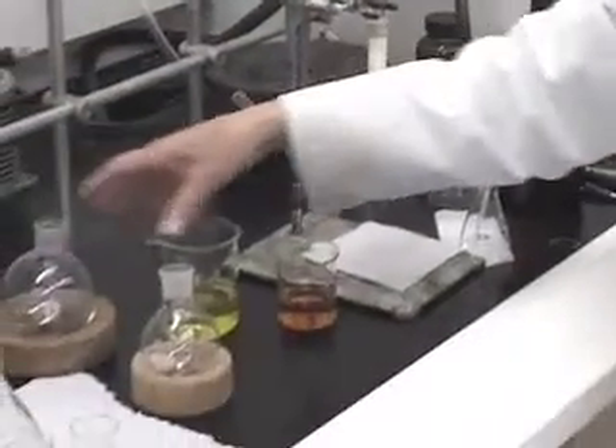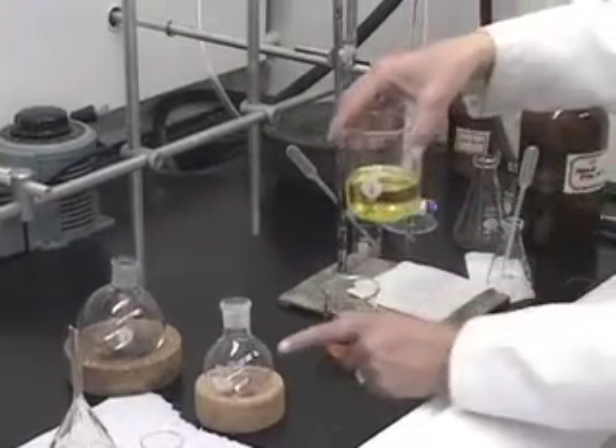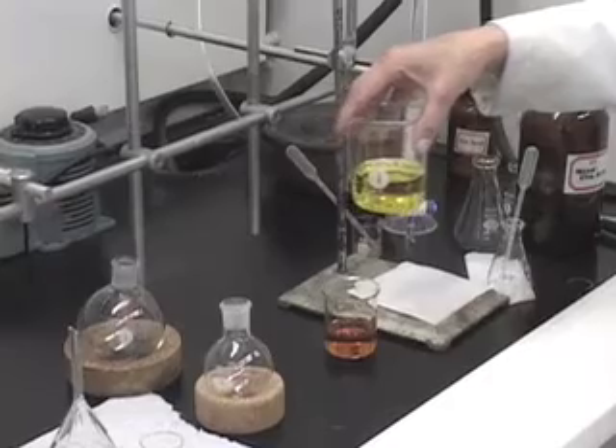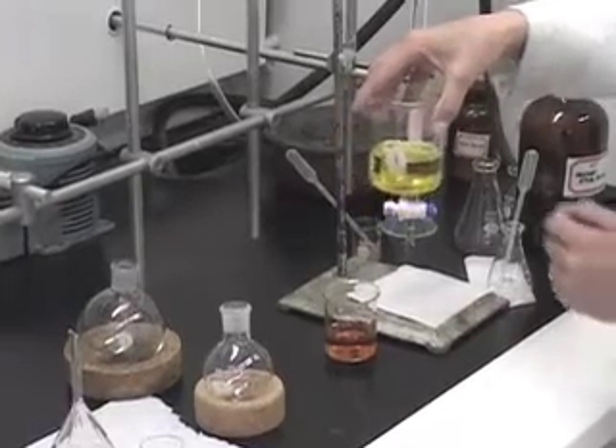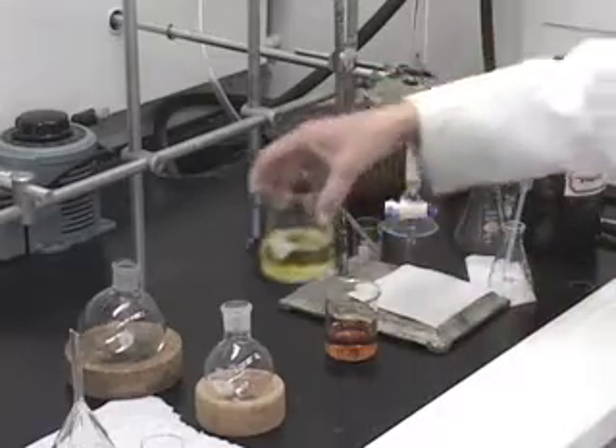Because I had about 100 ml of the yellow fraction, I could not use a 100 ml flask to rotary evaporate this solution. That is the reason why I have a 250 ml round bottom flask.